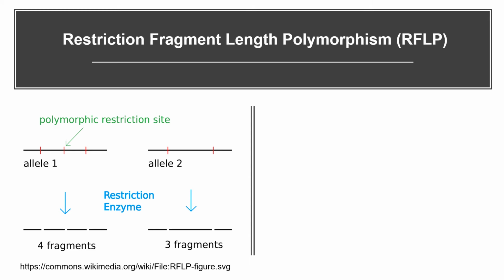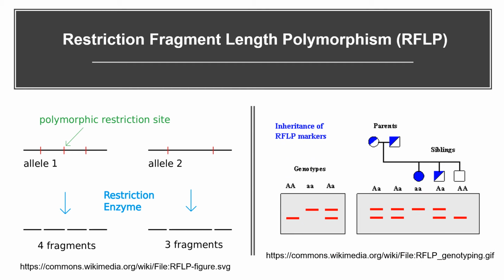In RFLP, the different lengths of DNA fragments are analyzed. Large sample sizes are needed for RFLP. These fragments are from the digestion of a sample of DNA with a restriction endonuclease enzyme. The enzyme chops DNA at a certain site, the restriction endonuclease recognition site. Whether or not particular recognition sites are present will provide different lengths of DNA fragments, which are then separated through electrophoresis.